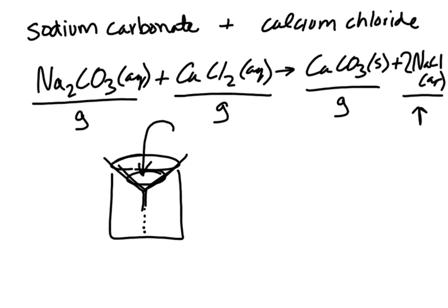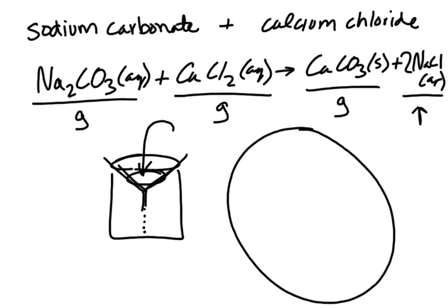Some important things to remember when you're doing this lab: on your filter paper, before you do anything with it, you need to get an ink pen, a ballpoint ink pen. Don't get a felt tip. Roller balls don't work that well either. Get a ballpoint pen, and I want you to write your period, so let's say period 2, and the first initial of everybody in your group.